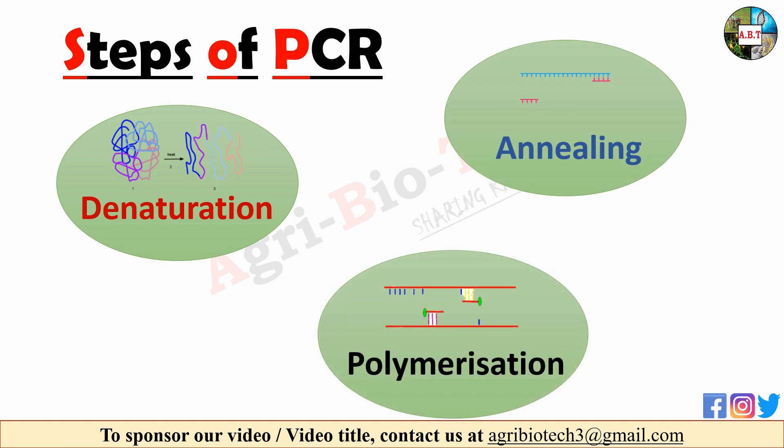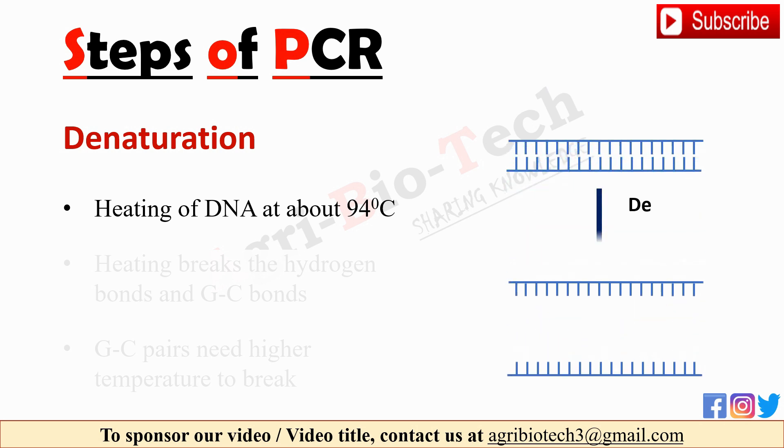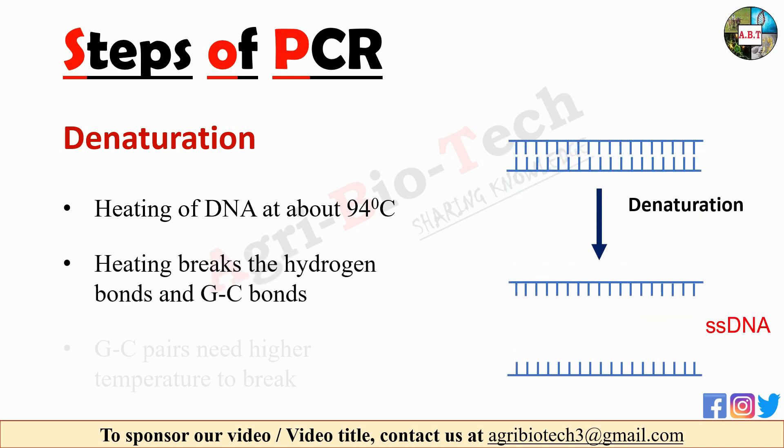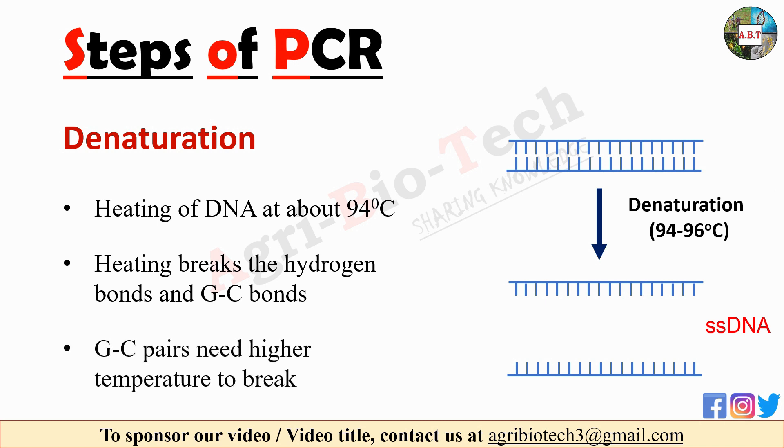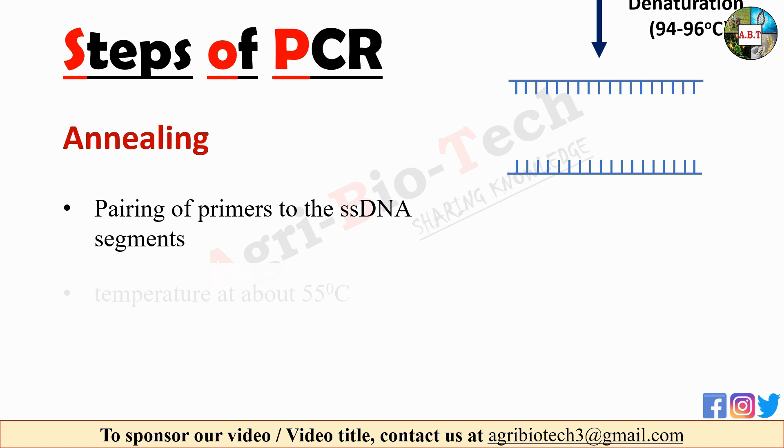The first step of PCR technique is denaturation. This step involves heating of DNA at about 94 degrees Celsius. This high temperature heating breaks the hydrogen bonds and GC bonds to make single-stranded DNA. DNA molecules with more GC pairs need higher temperature.